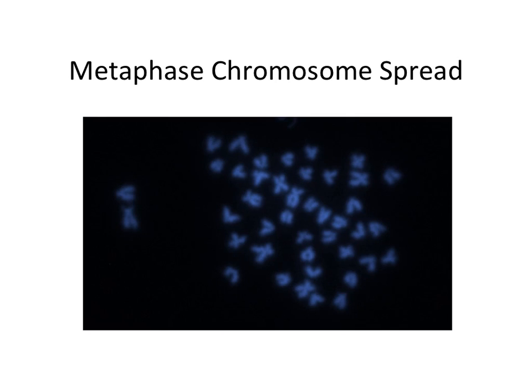Today's video is about cytogenetics, or our ability to look at chromosomes and obtain important information from them. Shown here is a metaphase chromosome spread. This is the set of all of the chromosomes that were in the nucleus of a cell at metaphase.